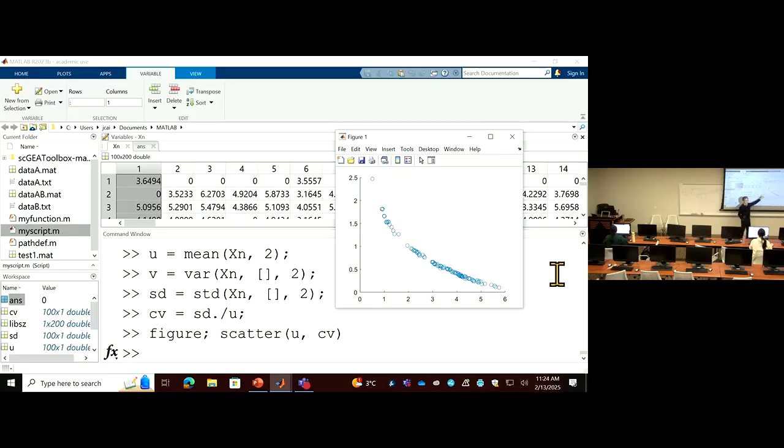This curve is so clean that it's not what we normally see in real data. But it indicates there's some internal link between these two variables. That's why I gave you such a beautiful curve. There's no simulated gene that jumps away from the curve. They all follow this pattern nicely.